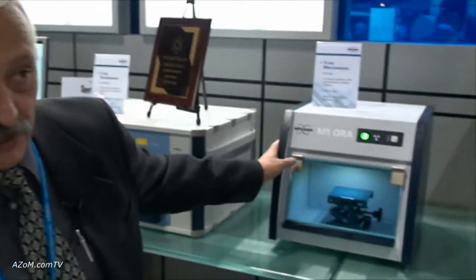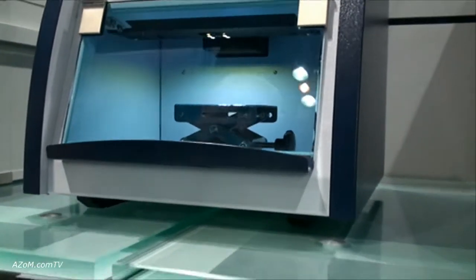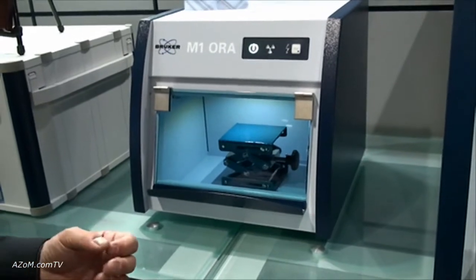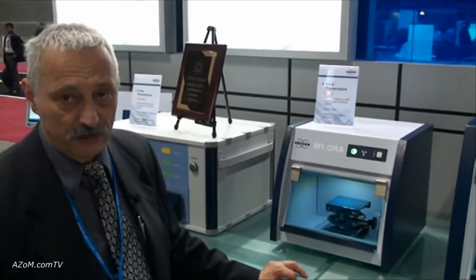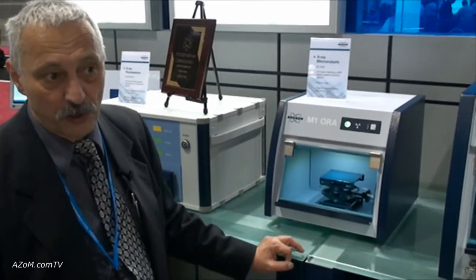Bruca recently started with a new product line: Micro X-Ray Fluorescence. We have three different instruments. We start with a very small one — in that case we have a spot size in the range of 0.3 to 0.5 millimeters. Excitation from the top makes it possible to analyze very small filigree parts, for example jewelry. The value of jewelry depends very strongly on the gold content in the alloy, and that can be analyzed with this instrument very exactly, with an accuracy in the range of 0.2 to 0.3%.